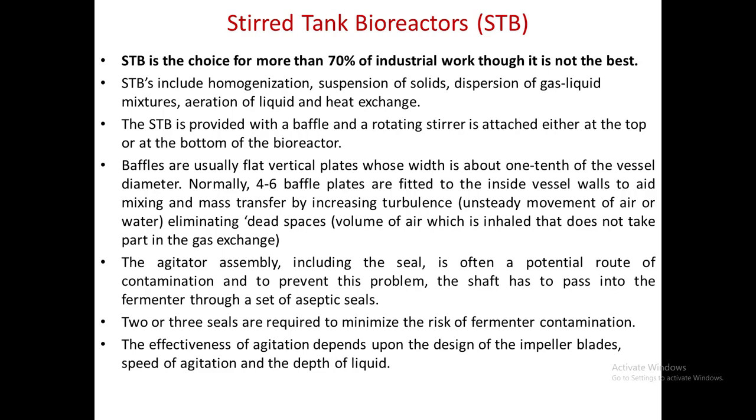The homogenization of suspended solids, dispersion of the gas-liquid mixture, aeration of liquid, and heat exchange are done through the stirred tank bioreactor. It is provided with baffles, and a rotating stirrer is attached either at the top or at the bottom of the bioreactor.